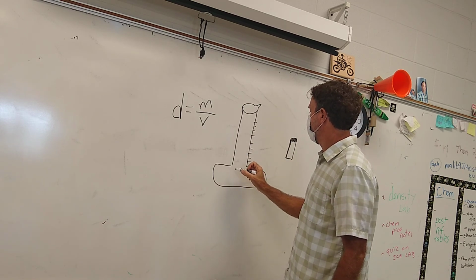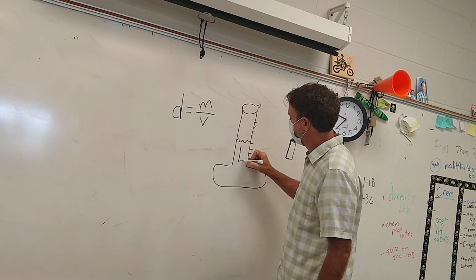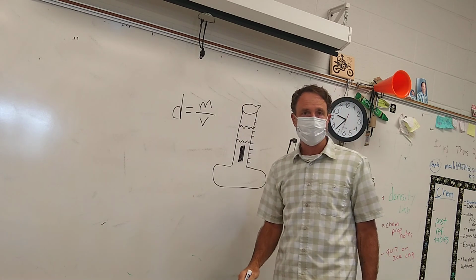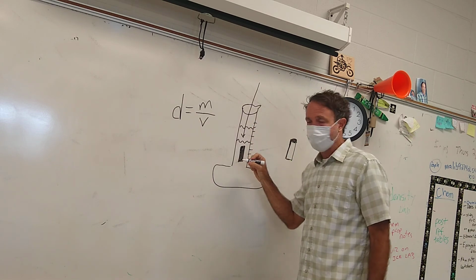And then we'll put some water in it. And then when we put the ingot in it, the water's going to go up. Does that make sense?